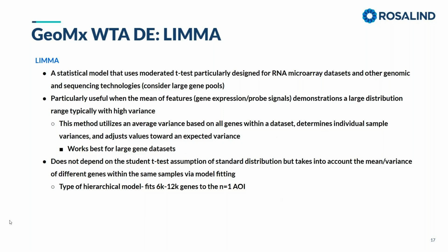So we're already getting a much better fit to what we want to see in our spatial data. But we also have a similar non-assumption of standard distribution. So this is similar to what we saw in Wilcoxon, where maybe this is where we would want something with less power, right? So this is something where you have less N in your data set. So maybe we can do something better.